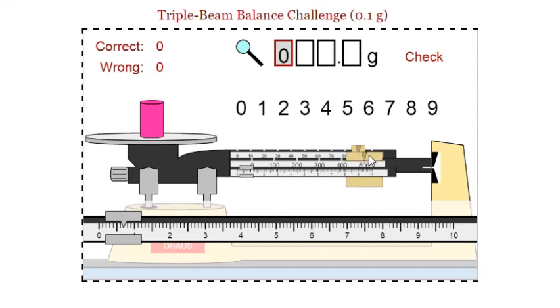So that's a 500 there, and if you can see on the back rider: 0, 10, 20, 30, 40, 50, 60, 70, 80 - it's actually on the 90 spot, so that's 590.